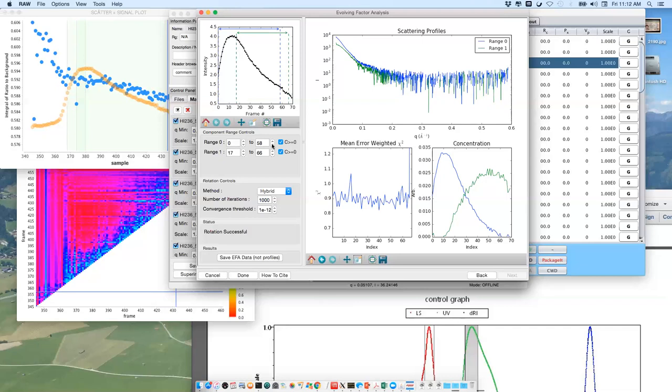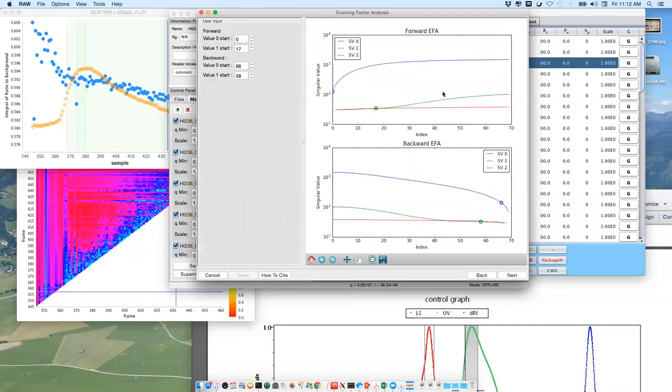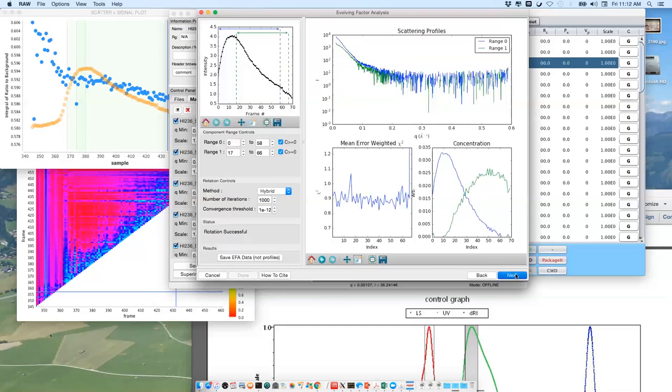So if you define the number of components right after selecting where the components are contributing in the previous graph, by clicking here you already have the final solution. So now you are able, not only do you need to save these scattering profiles, what is basically shown here. And when you look at those scattering profiles more clearly, they are really different.